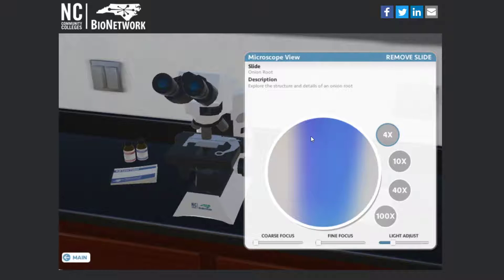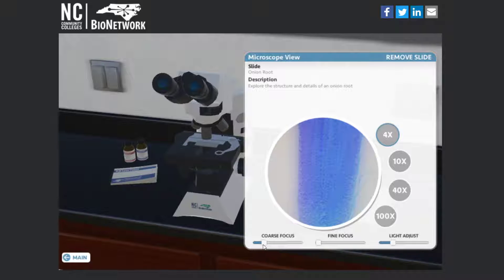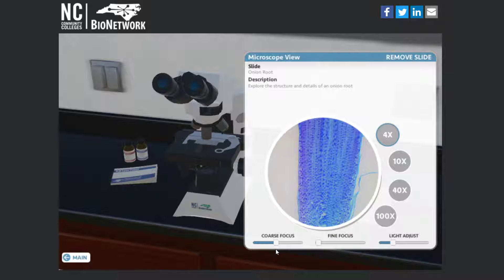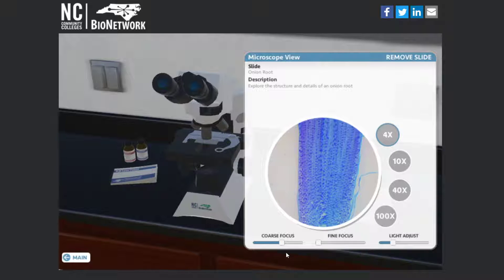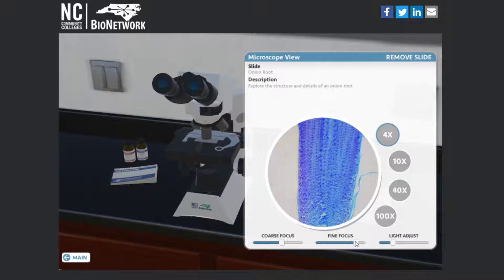You can see that it's not in focus, so you should start with the coarse adjustment and get it where you want it. Then you can use the fine focus to make that image really sharp.